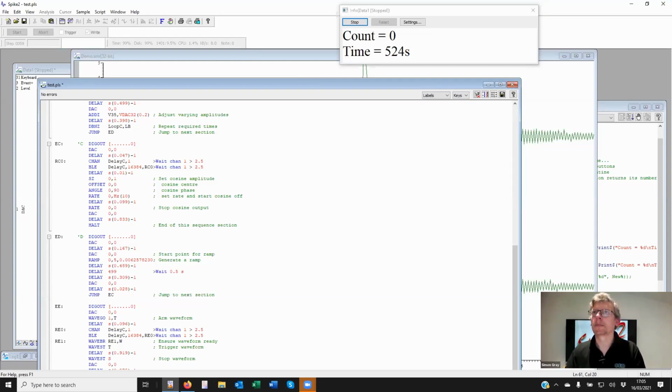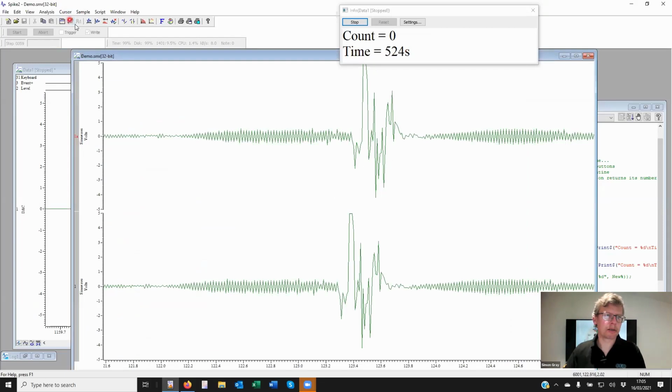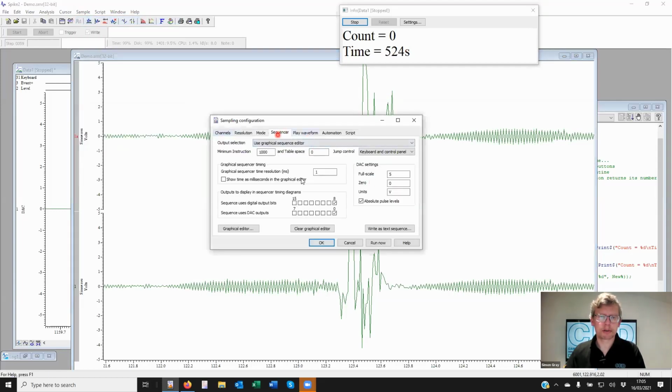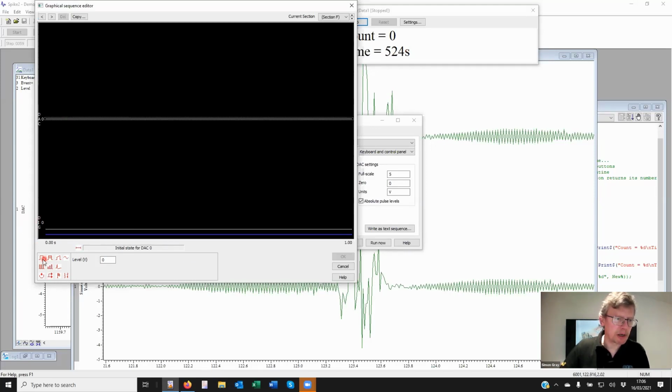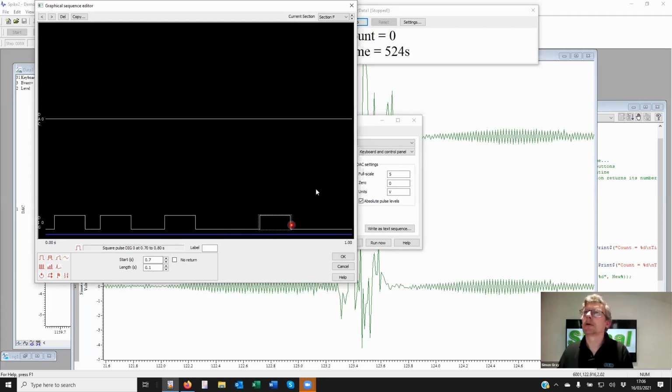So let's just think what we can do for you right now, Tabitha, and that's let's go sequencer, sample sequencer there. Let's go to Graphical Editor. Okay, so we're on a next one, F here. Here's a pulse. Oh, sorry, that's the analog line. I want it on the digital line. Here's a pulse. Here's a pulse. Here's a pulse. And here's a pulse. Okay.